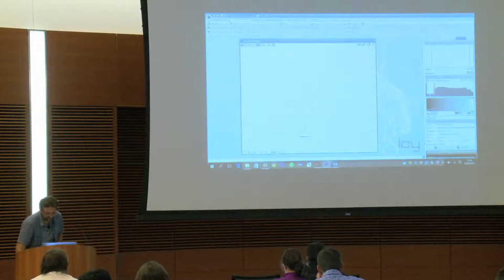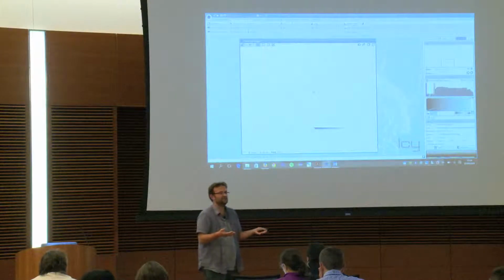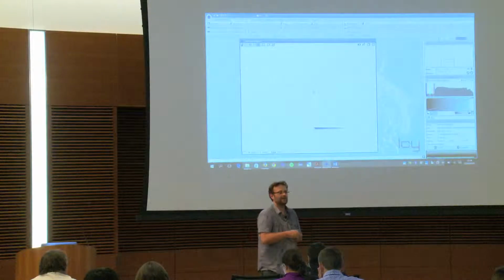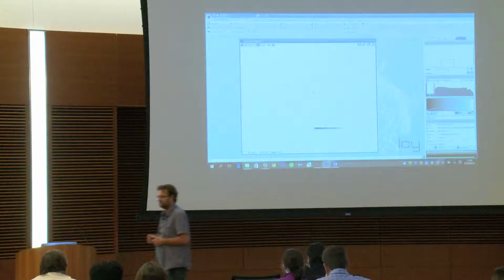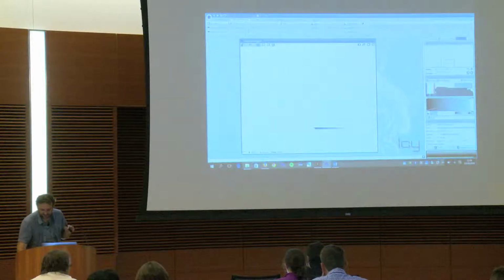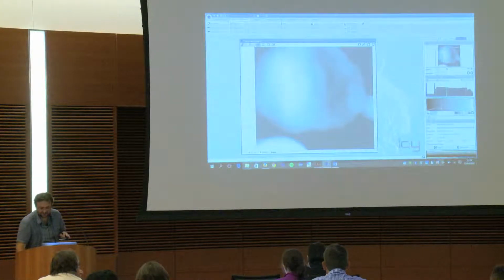So your background is most of the time 11,000, and in here, if you zoom a little bit, you see that in fact the apertures just dive into the sample, or maybe it is the initialization, I don't know, but it was this thing that was here, okay? In fact, there is a lot of other things that you can find in this image, but I will stop here with this example. It was just to convince you that if we put this lookup table thing, this histogram, this capability to play with these things, it's not really for nothing.